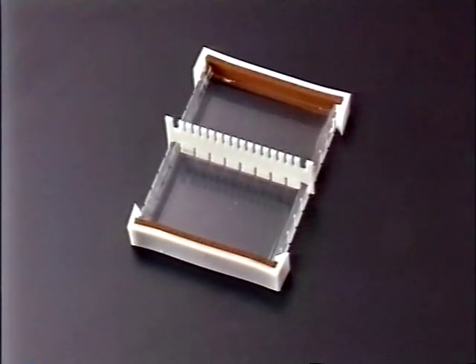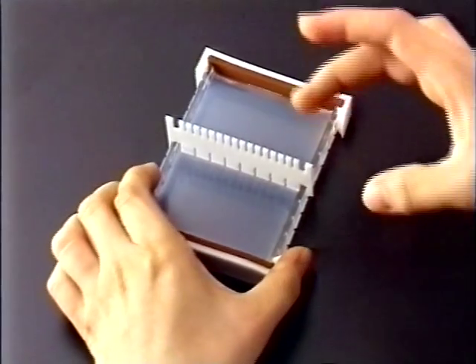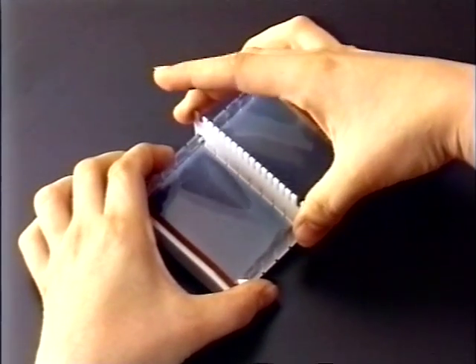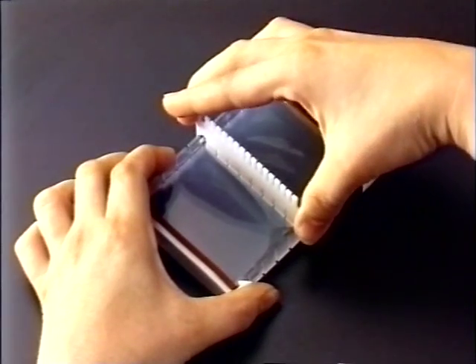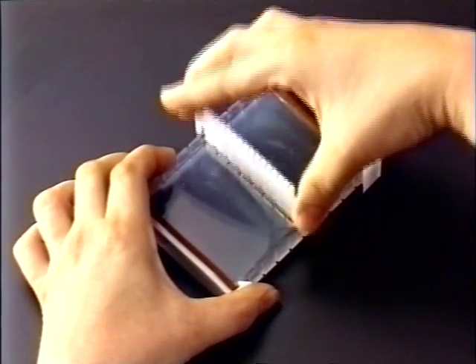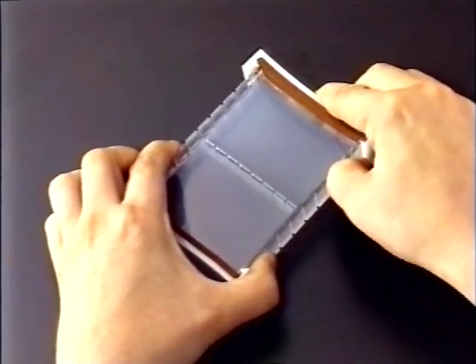Allow the agarose to solidify for approximately 20 to 30 minutes. The agarose gel will turn from clear to opaque when it has solidified. Gently remove the comb from the gel. Remove the end dams from the gel casting tray.